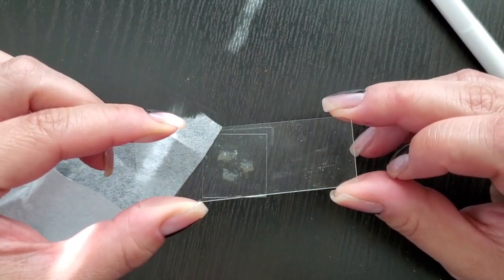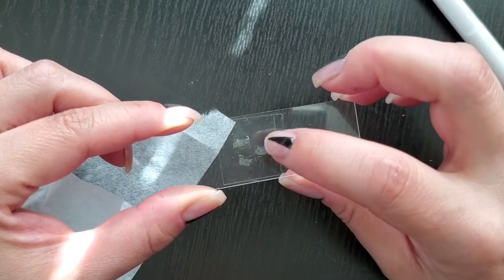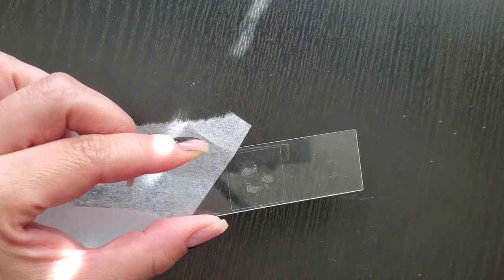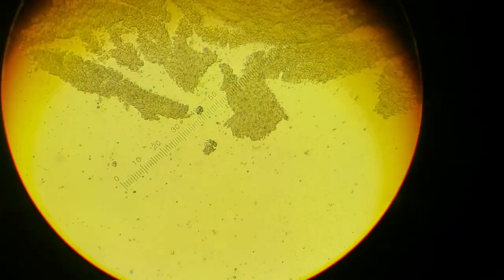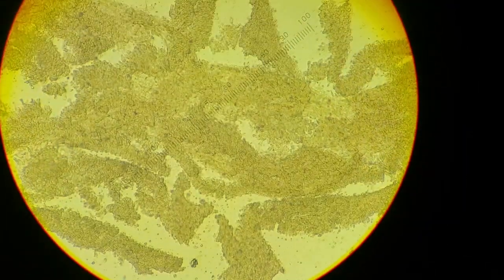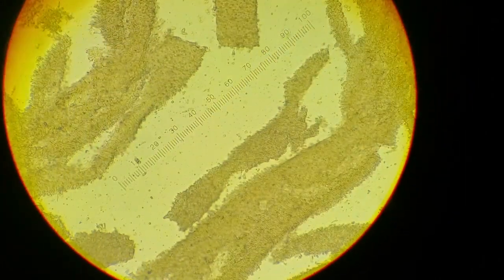So they're pretty squashed. So I'm going to add oil immersion again and see if we can see any spores and count them and look at the structures, how they would appear under a squash mount after a proper gill section. Okay, so here is my squash mount. It could have been better, it could have been more squashed out, but just to give you an idea, what you end up doing is something a little bit like this.